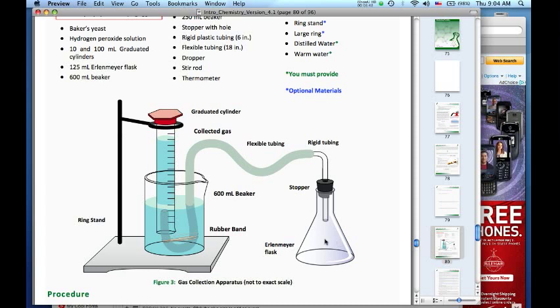So hopefully you won't be upset about 10 minutes of your life being wasted holding this container. And just think about how much you're doing for science while you're doing it. If you up the temperature, that'll make it go a little faster. If you want to dunk this in warm water, not boiling water, you'll kill the yeast, but warm water might speed things up too.